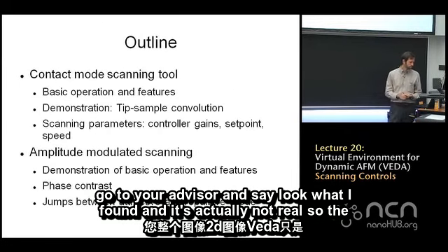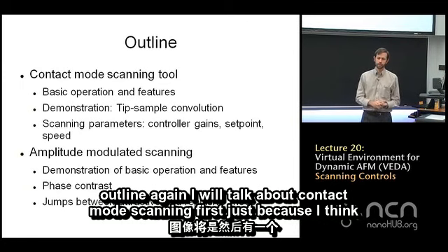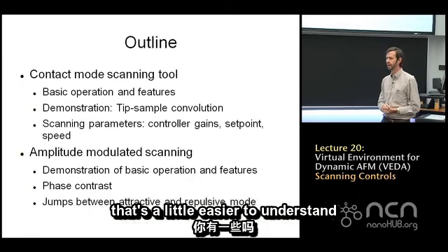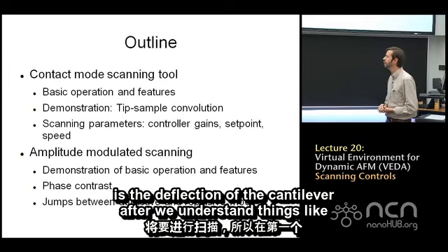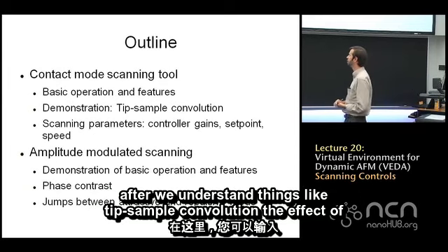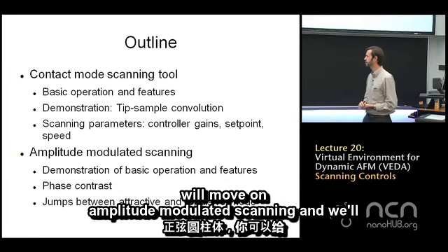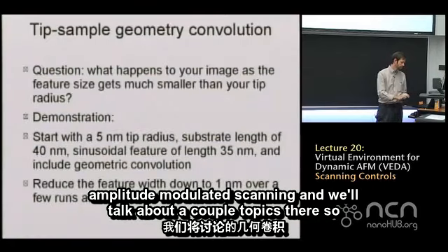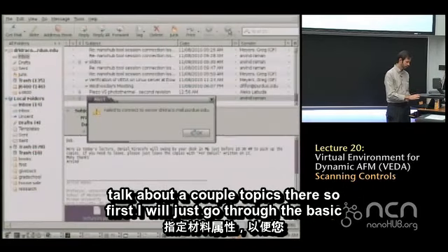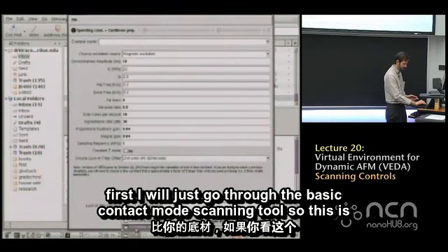So, the outline, again, I will talk about contact mode scanning first, just because I think that's a little easier to understand. There's just one variable involved, which is the deflection of the cantilever. After we understand things like tip sample convolution, the effective controller gains, and set point, then we will move on to amplitude modulated scanning, and we'll talk about a couple topics there. So, first, I will just go through the basic contact mode scanning tool.